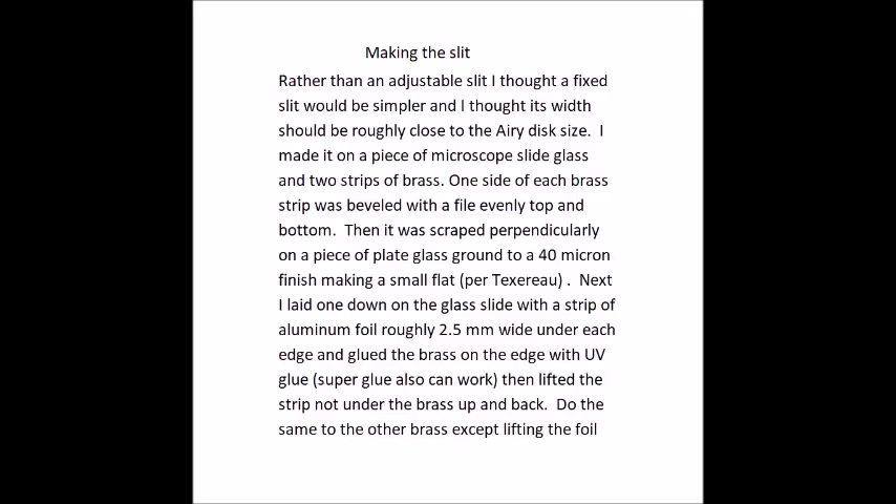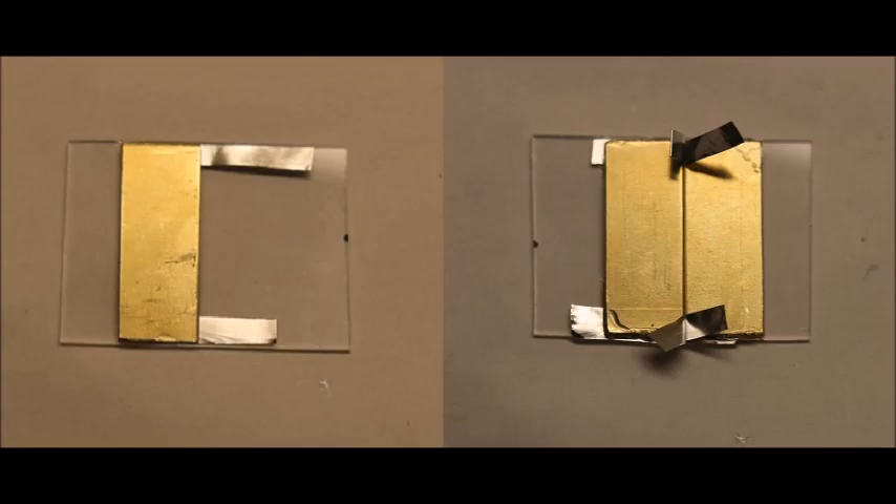Here's how I made a fixed slit for the spectroscope — it was a bit tedious. When finished, I taped it behind the opening in the front slit with aluminum tape.